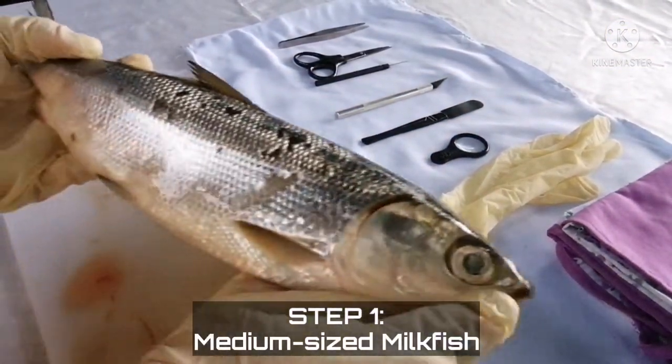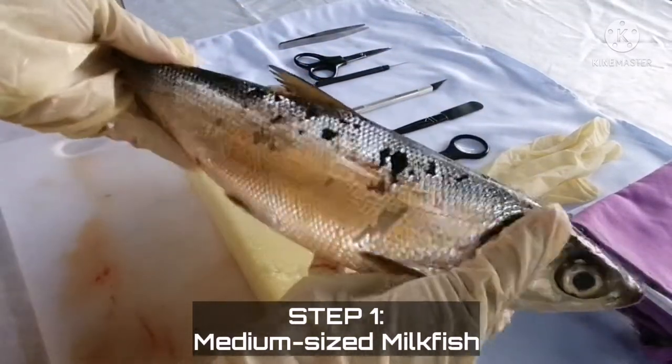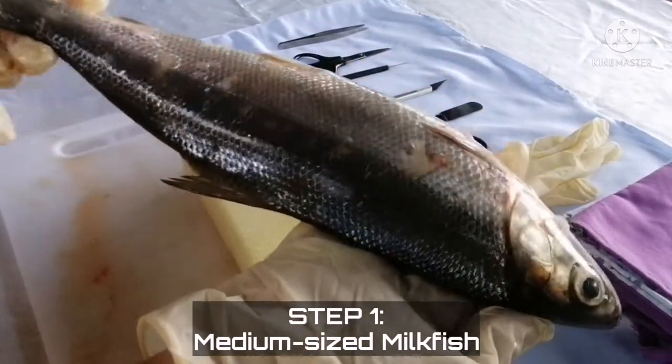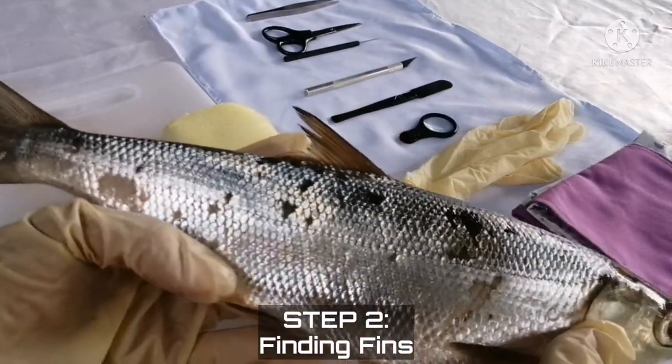So we have a medium-sized milkfish to be used in our dissection. It is important to choose a fresh milkfish for the dissection to avoid contamination. Now, let us identify the external parts of a milkfish by finding its fins.